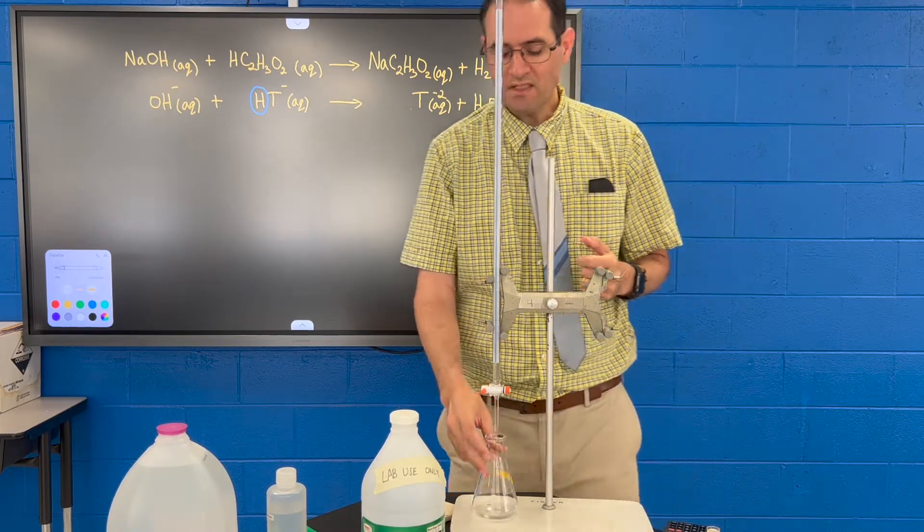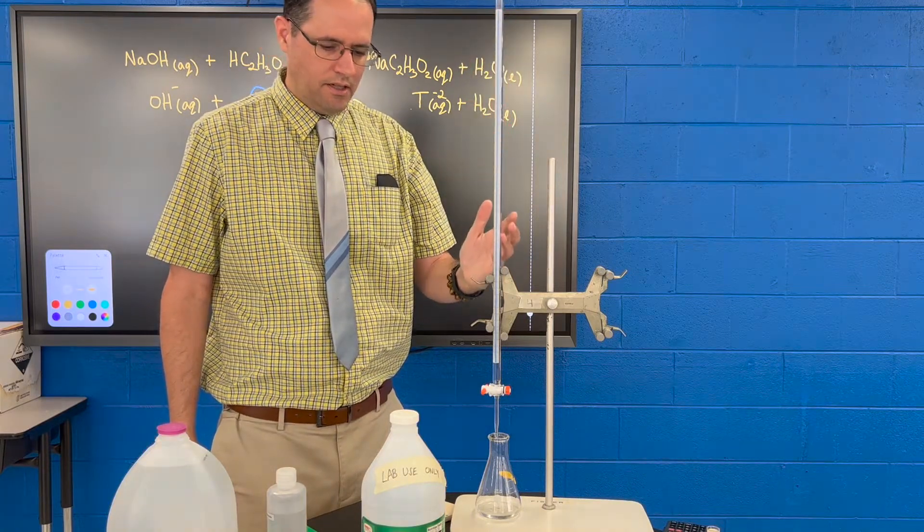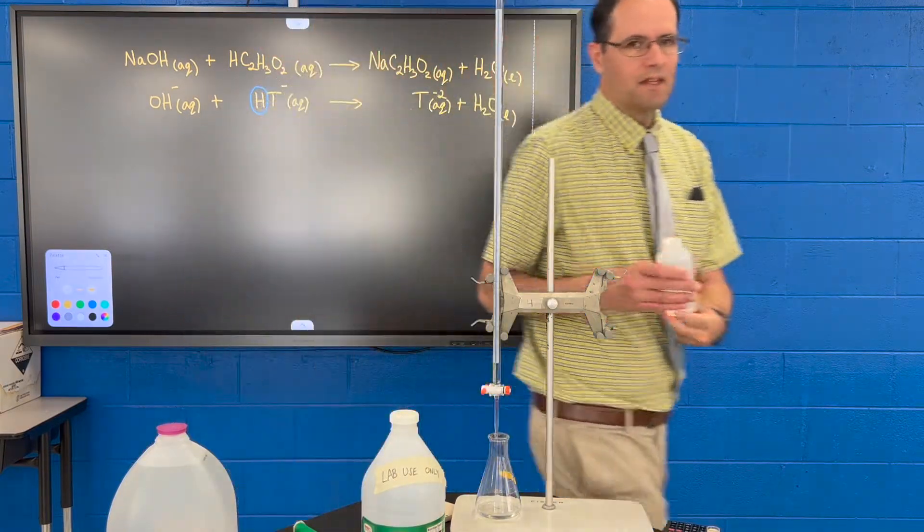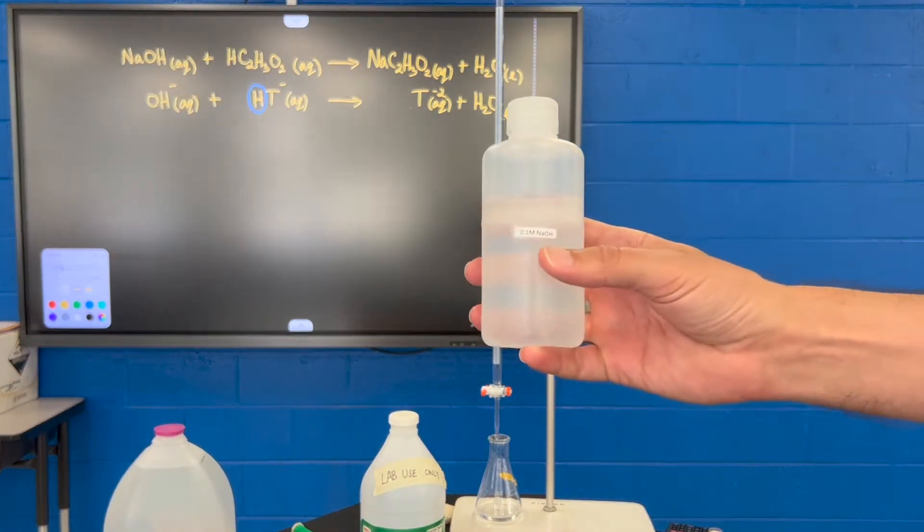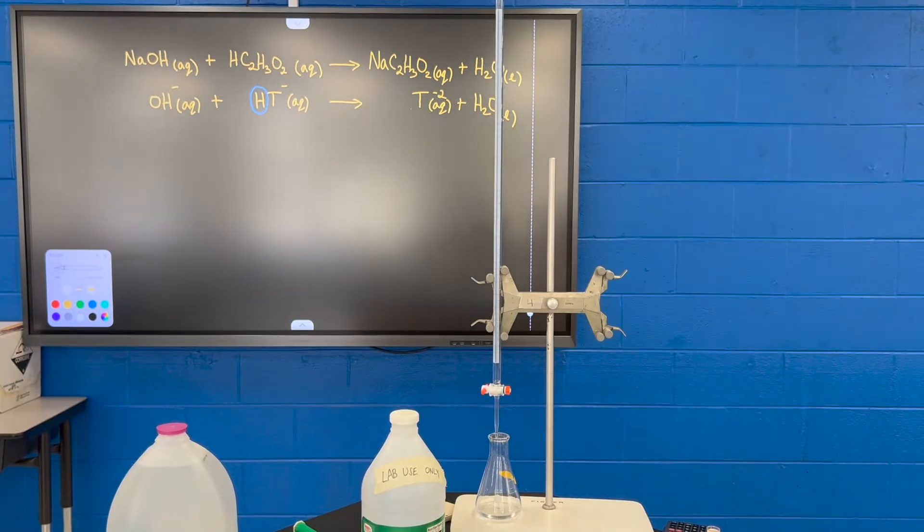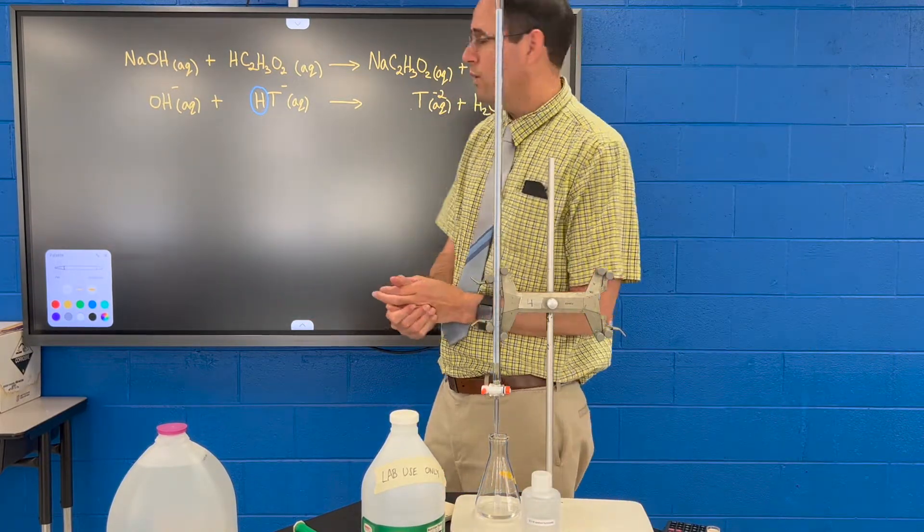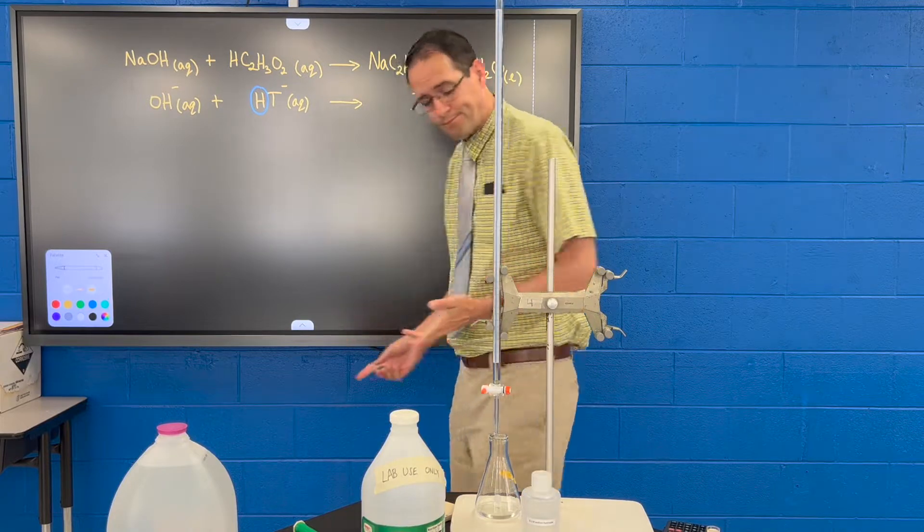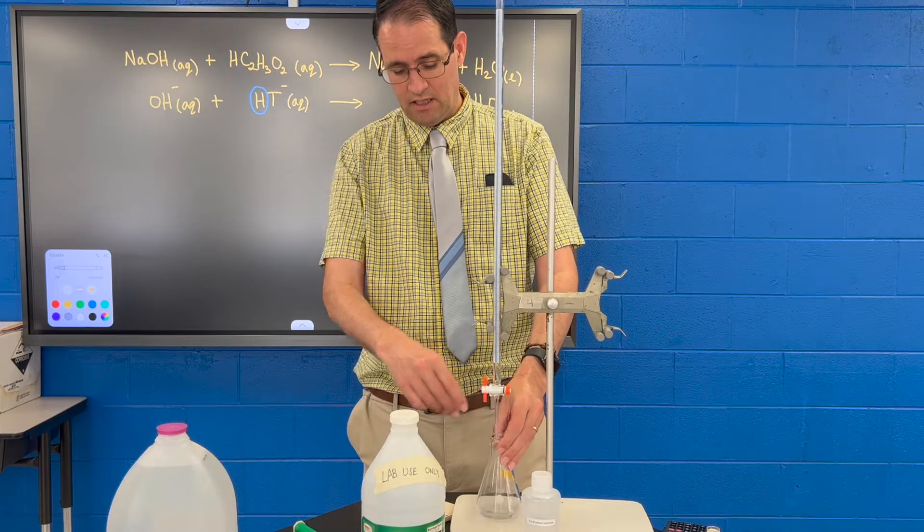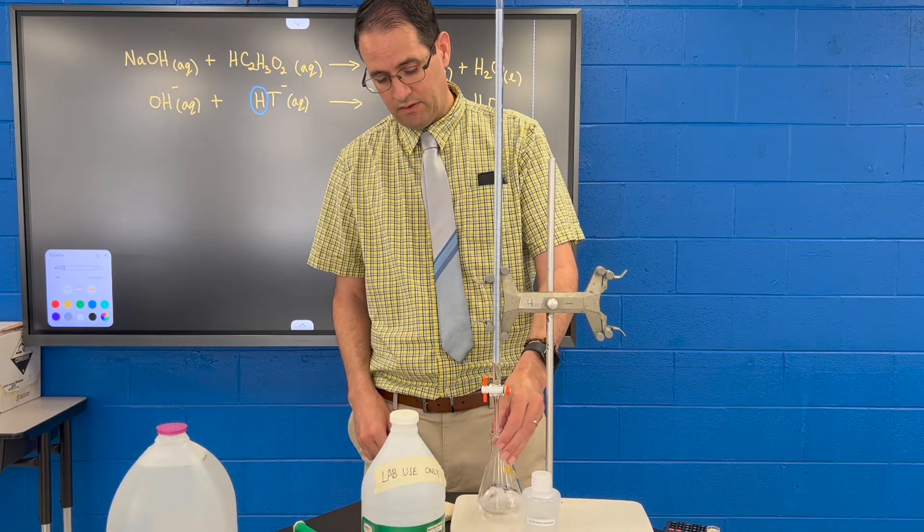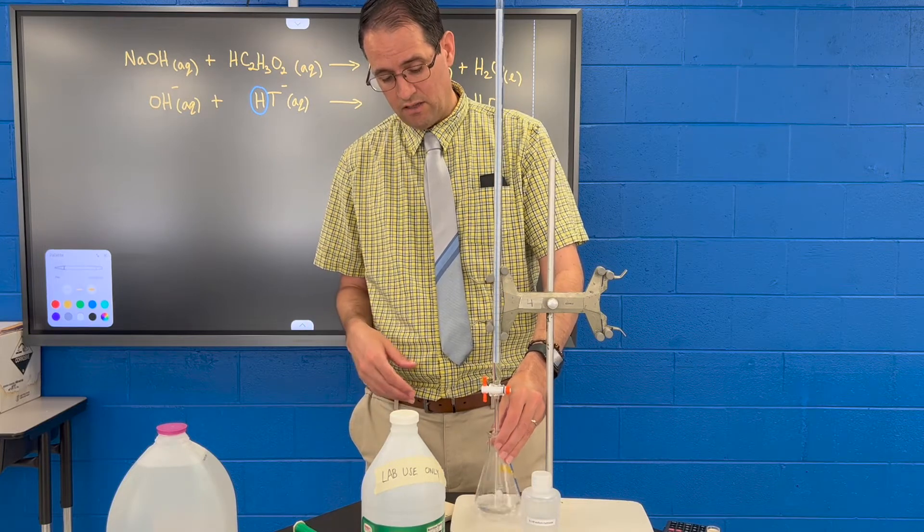Now in this very nice calibrated burette here, we're going to add sodium hydroxide. And it's very important that you write down the molarity of sodium hydroxide of the stock solution. In this demonstration here, it's 0.1 molar. So we're going to go ahead and just blast this in here until there's a color change, and then we'll call it quits so we can see the color change and then just do some calculations here.